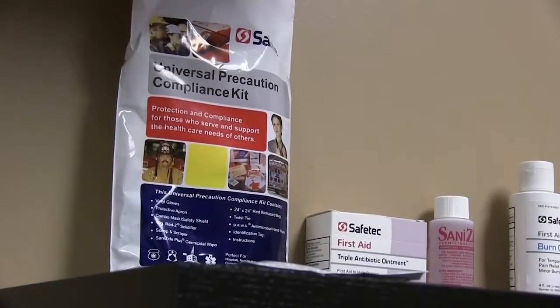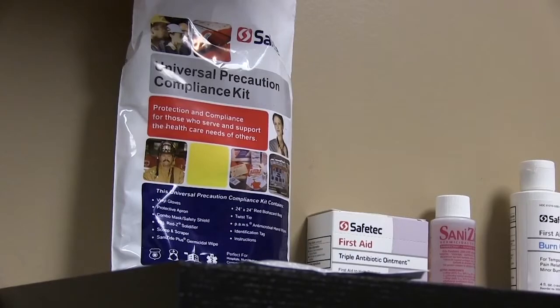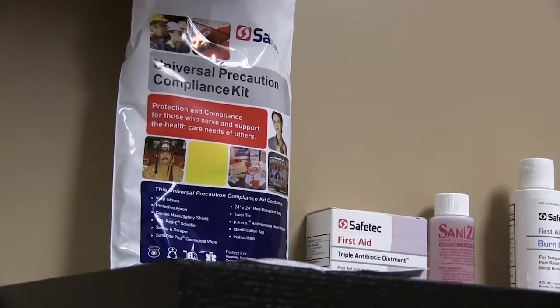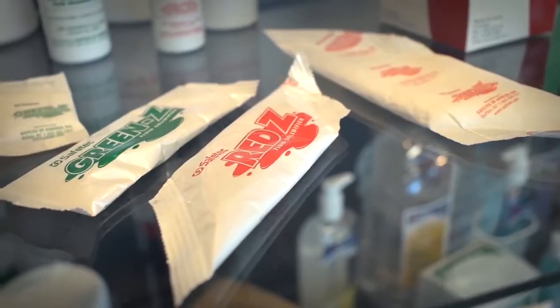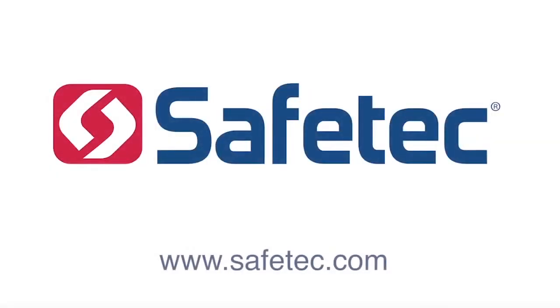Those were the five steps of the Universal Precaution Kit. The kit is designed to help in OSHA standard compliance. To learn more about this or any of our other products, please visit us at www.safetec.com. Thank you.